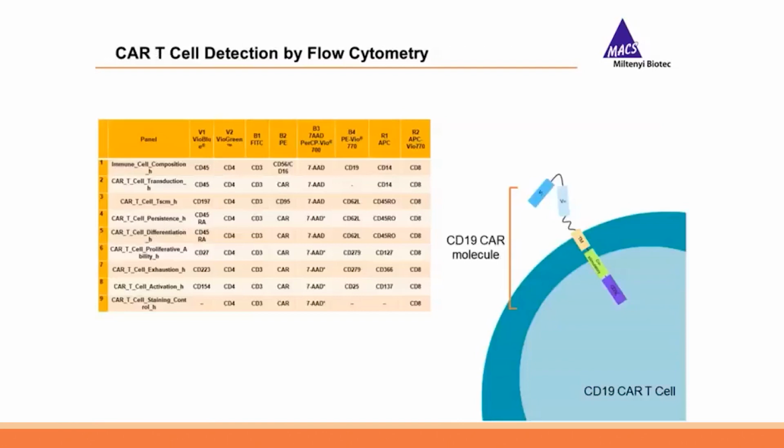The last few minutes of this webinar will focus on reliable detection of the expression of the CAR molecules on the CAR T cells, and what kind of considerations have to be included in using the right detection reagent.